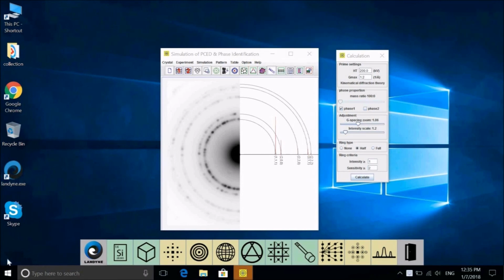You may also save the diffraction HKL and intensity list to a file. And here you can select which items go in the file. By default it is just HKL and arc intensity. You can also include the G and the D here, or the ring intensities.